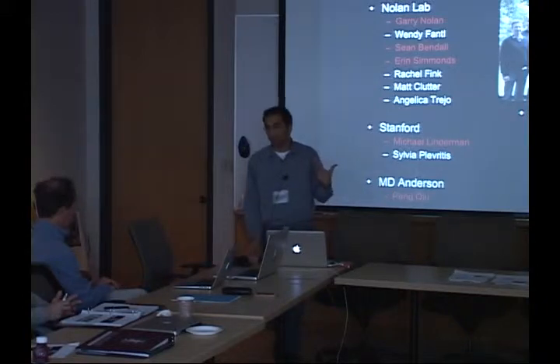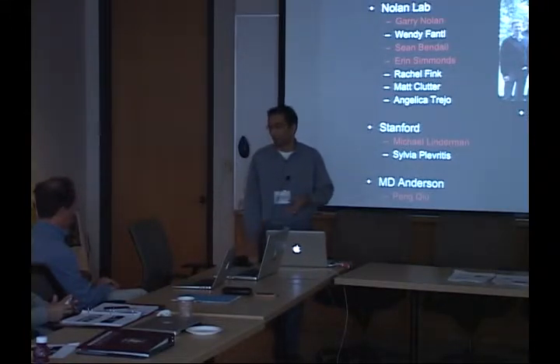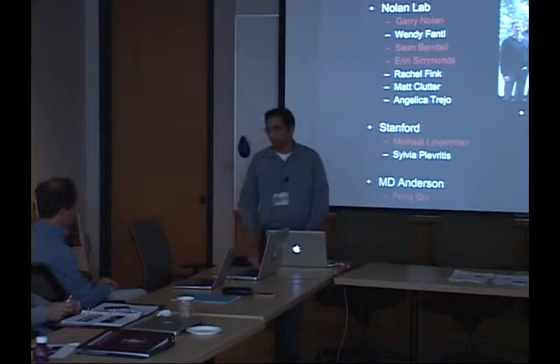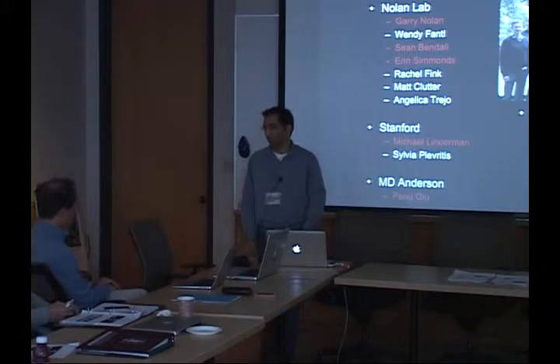In fluorescence, the biggest limitation is that a lot of these cell cycle markers, like the DNA intercalators, they're so bright, so they sort of take out your whole laser. So that's one limitation. But if you can design the experiment properly, you can still do probably 5 or 6 other colors in addition to cell cycle analysis. And I've never found, I mean, I don't do a ton of fluorescent cell cycle analysis, but I've never found populations that you couldn't analyze.